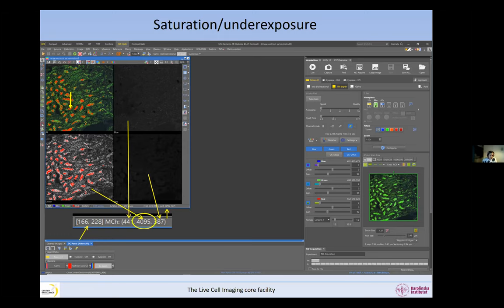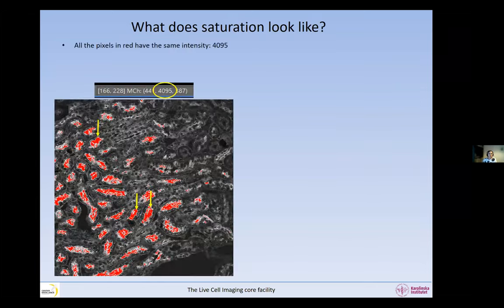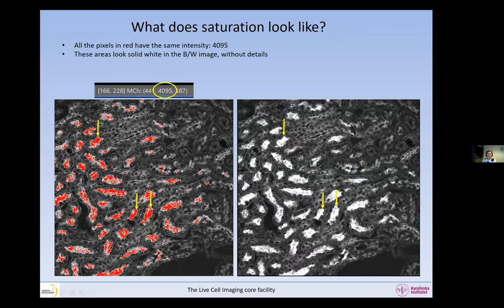So this is what the problem is: 4095 in this channel — that is saturated. Wherever we put our mouse over the red pixels, we always get 4095. All these red pixels have the same intensity. If I remove the red color and look, I can see that all these pixels look exactly the same. There is no detail at all in these areas.